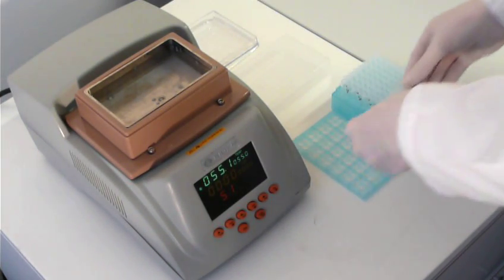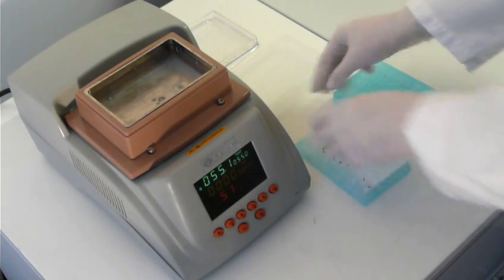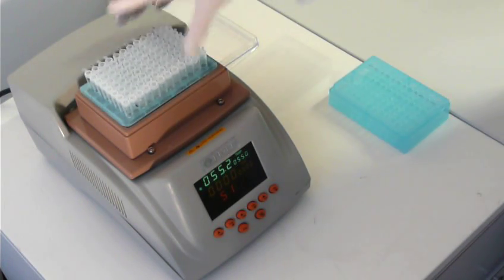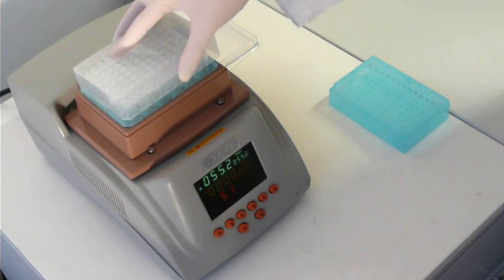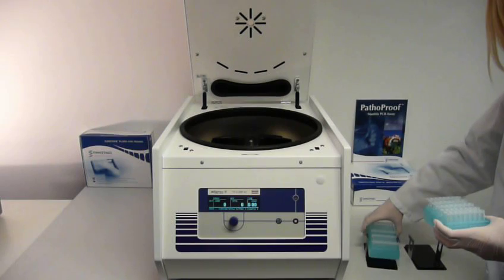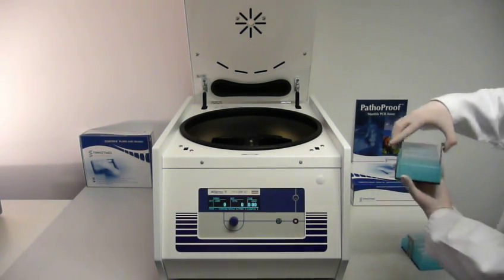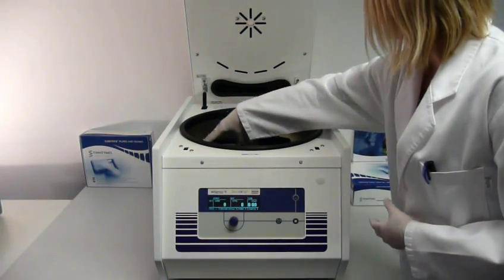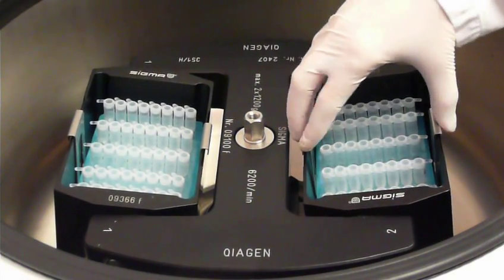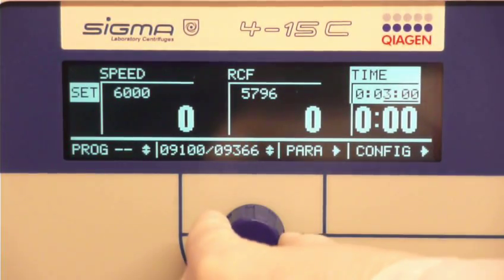After adding a lysis reagent, the sample is incubated to break up cell walls and to release the bacterial DNA. Subsequently, the samples are centrifuged at high speed, separating the lipids from the aqueous phase containing the DNA.